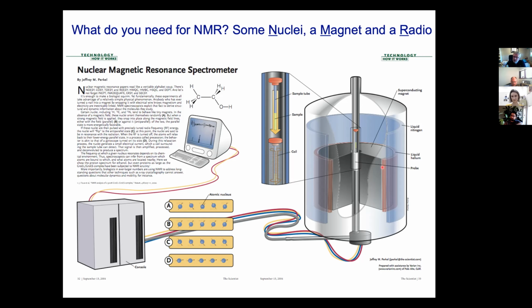Still cold because it's isolated between the different layers. So the way they make these magnets is you basically have a thermos within a thermos. So this thermos here is filled with liquid helium, and there's then a coil in there to which they run all kinds of currents, and that generates a really large magnetic field right at the center of where this vertical bore actually runs and where the sample is going to go.